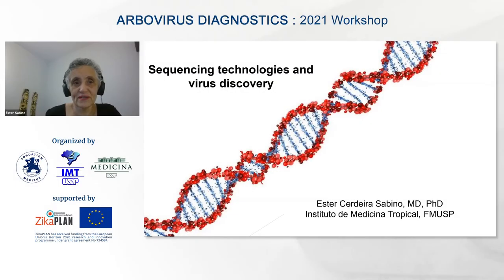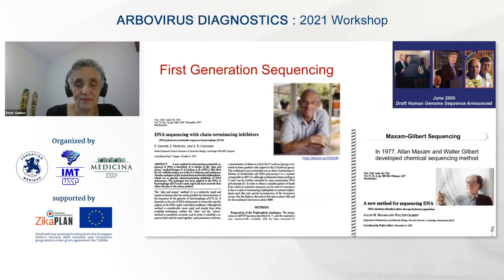Hello, we are going to talk about sequencing technology and virus discovery. I think there has been an amazing change in the way we do sequencing nowadays.